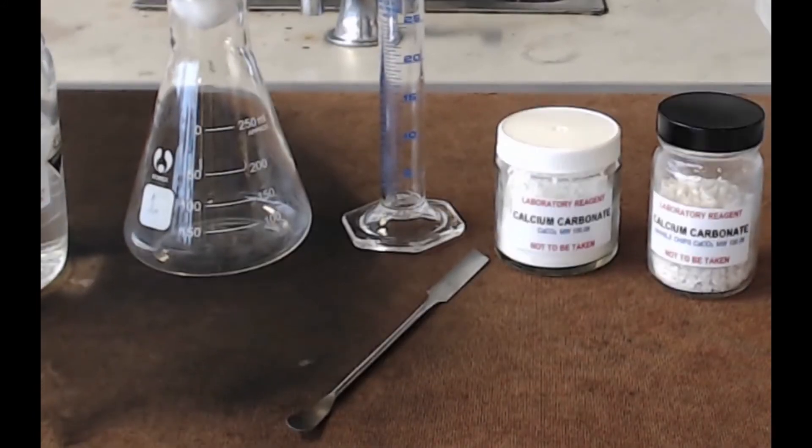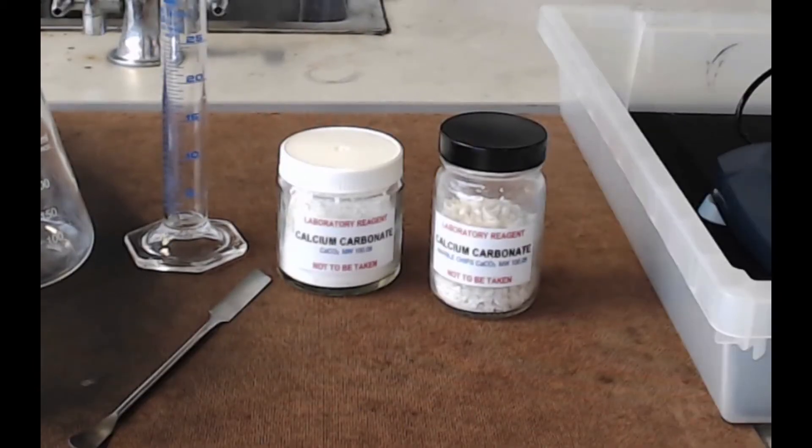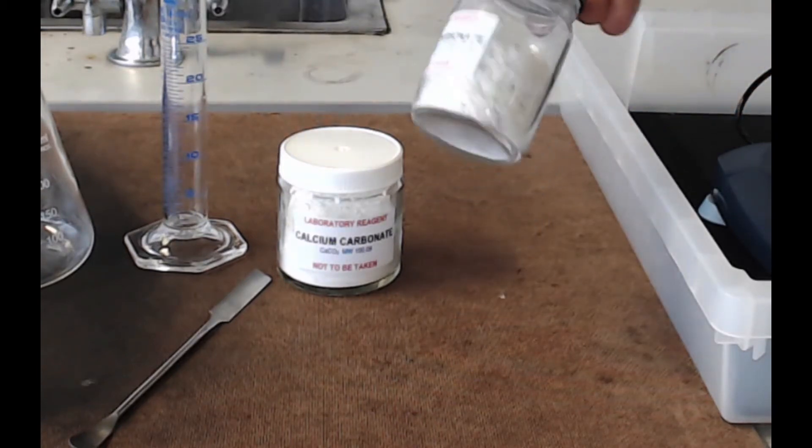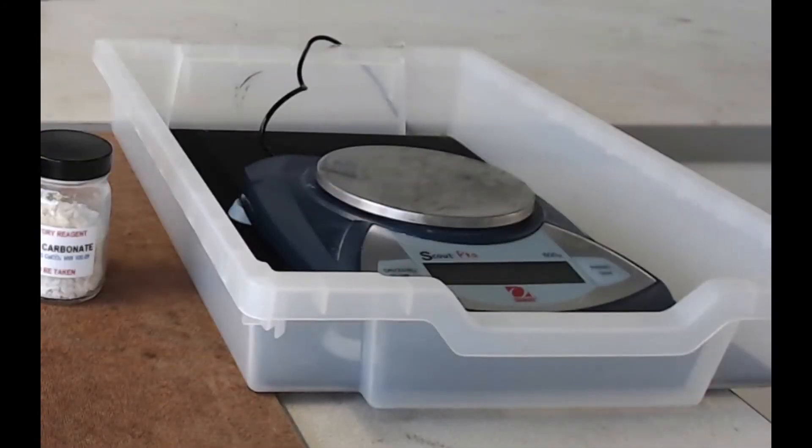You'll need a spatula for dispensing your calcium carbonate, two forms of calcium carbonate - a powdered form and another form called marble chips, which are like small stones - and a balance to weigh out your calcium carbonate.